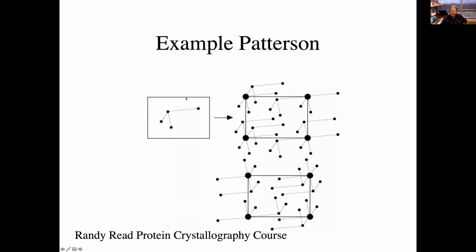So say you have a unit cell like this, and this is your simple molecule. The Patterson map will consist of all the interatomic vectors. Because this is a convolution, it's like putting each of these atoms at the origin and then adding where the peaks are in space for each movement of this object all around. Because it's zero except at these points, you move each of these points to the origin and plot where the dots fall.